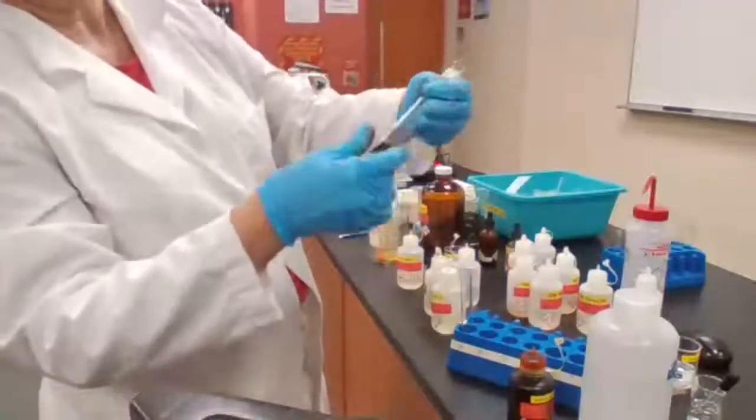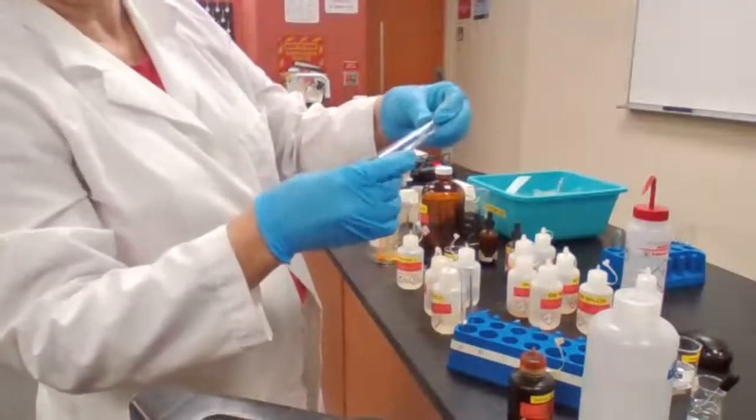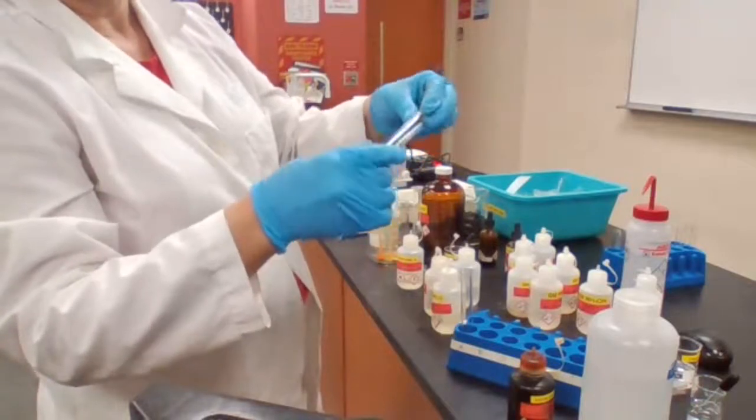It looks like this is the one, but I'm waiting for that mirror to form so you have evidence for the reaction.